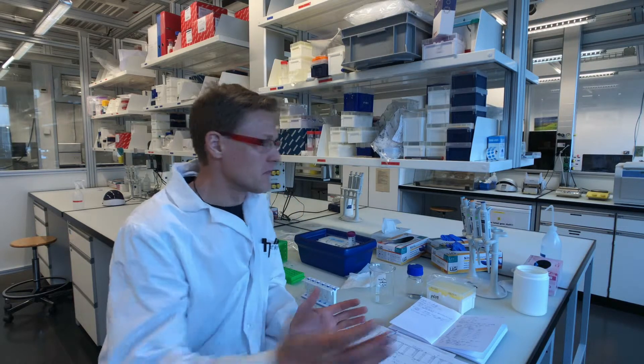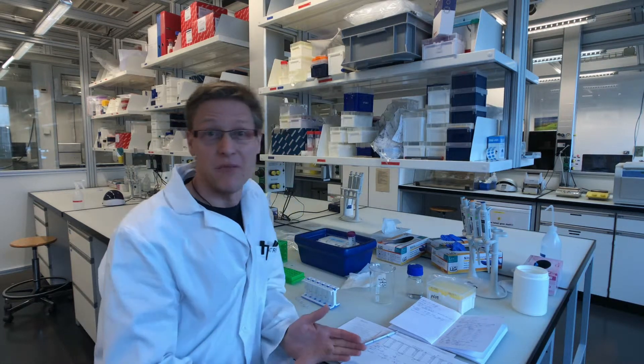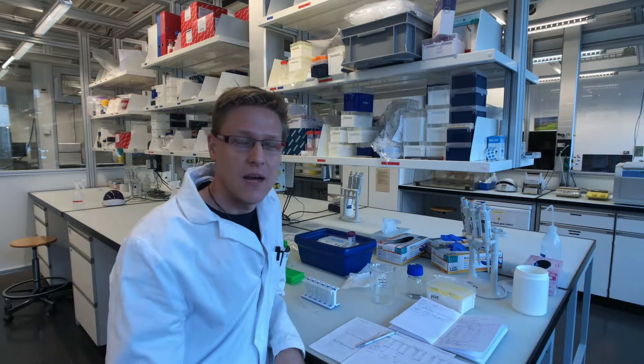Here we are in the Genome Diversity Center of the ETH in Zürich. This is a common lab space where any scientists can come in and do their lab work if you don't have your own lab, which is fabulous. I am here to make sequencing libraries.